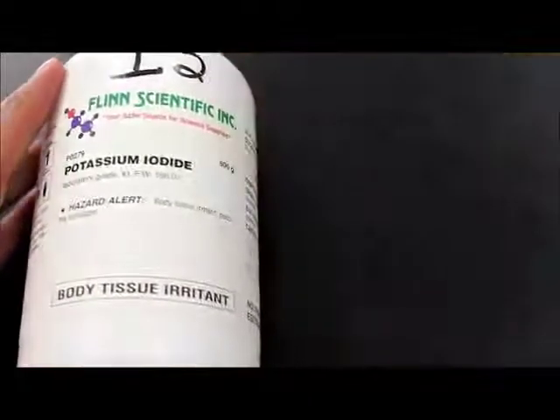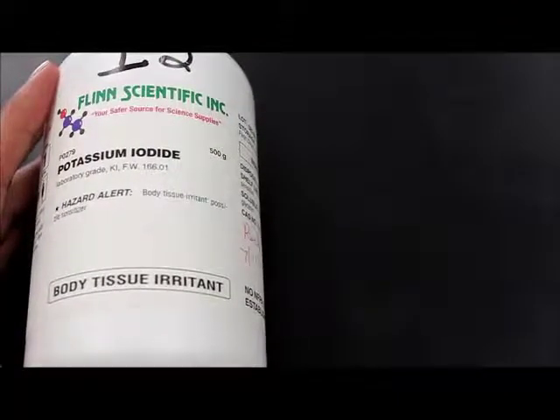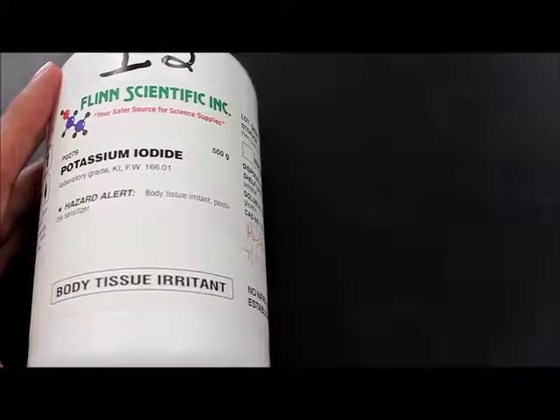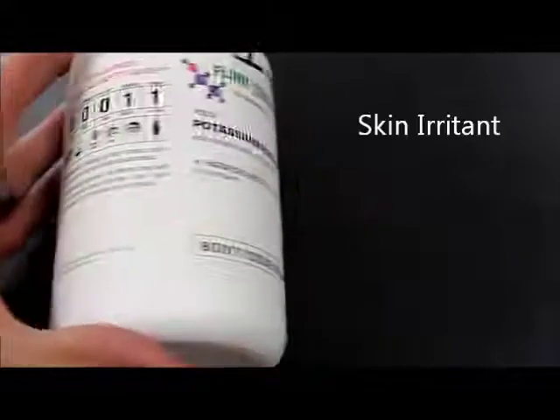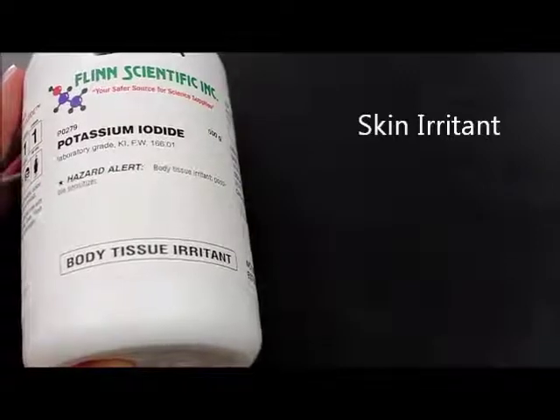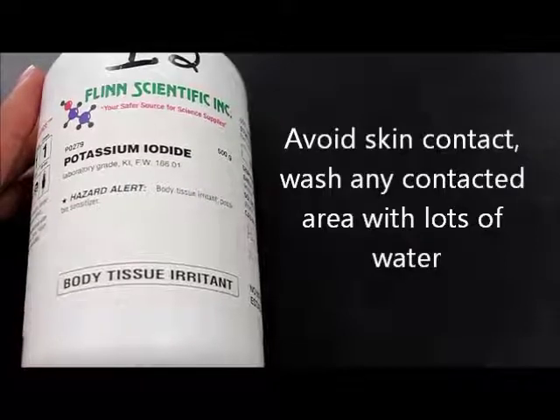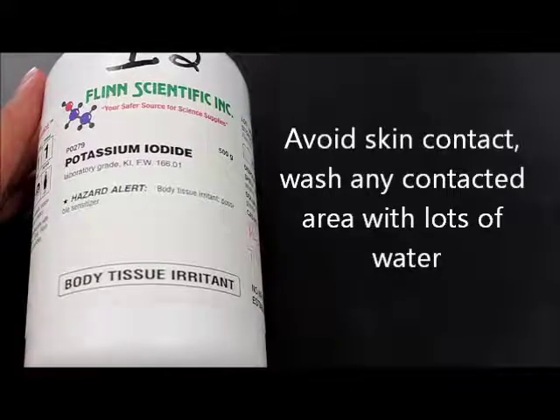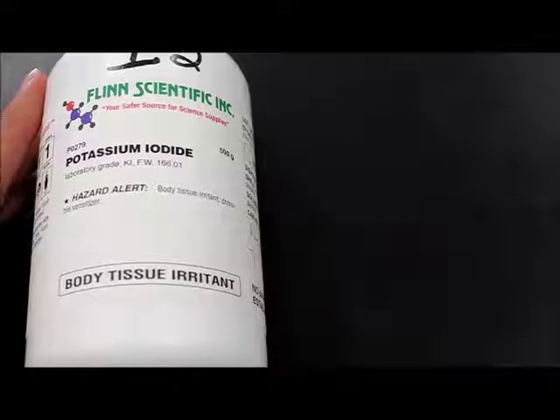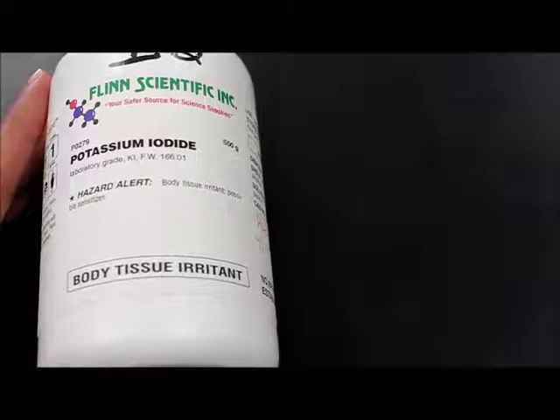Our other chemical that we're going to be using is potassium iodide. Now, potassium iodide is not as much of a health risk as the lead 2 nitrate or the lead 2 iodide that we're going to be using are. But a quick note, these are a skin irritant. So what that means is that if you get this on your skin and you leave it on your skin for a long time, you might become a little bit itchy where you got that on there. This is not a large problem. Just make sure that you flush whatever you get the potassium iodide on really well. If you got it on your hand, you want to flush that really well. And again, let's make sure that we're not ingesting or getting these into our eyes.